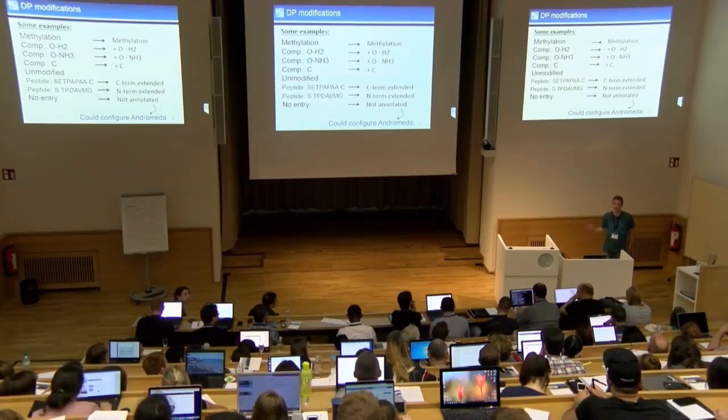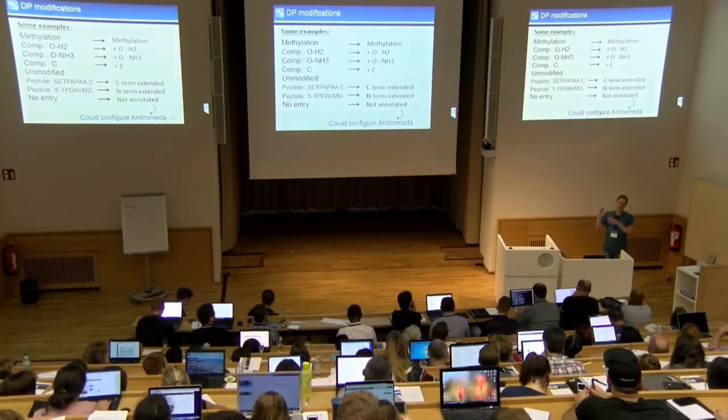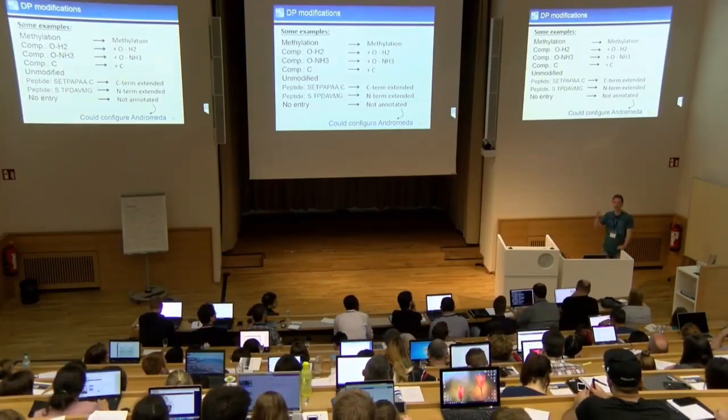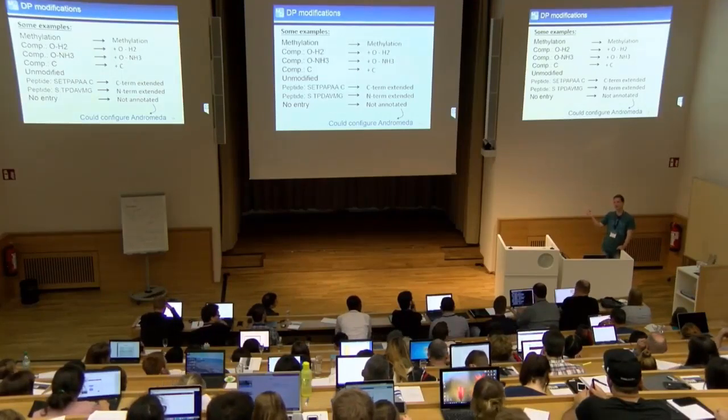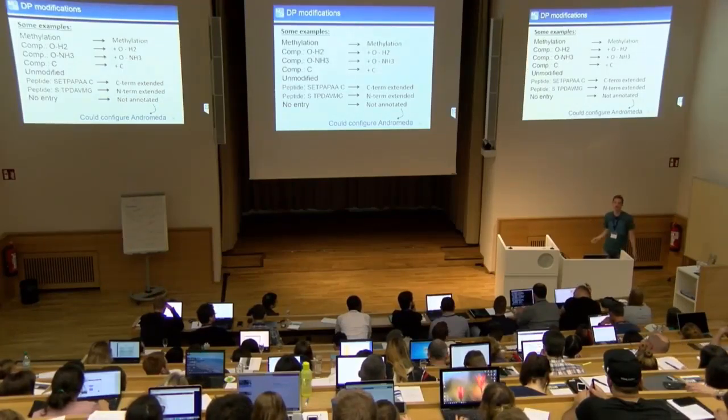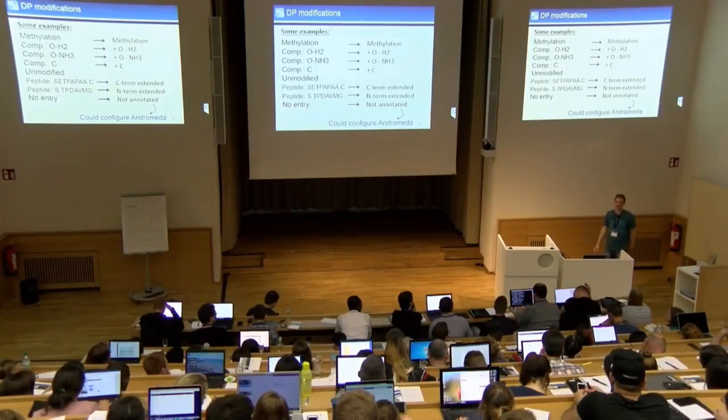The approach is analogous to the way that we do the protein database, where we also reverse the sequences and then do the in silico digest. So here we have exactly the same assumption, that these reversed peptides do not actually occur in the proper proteins.